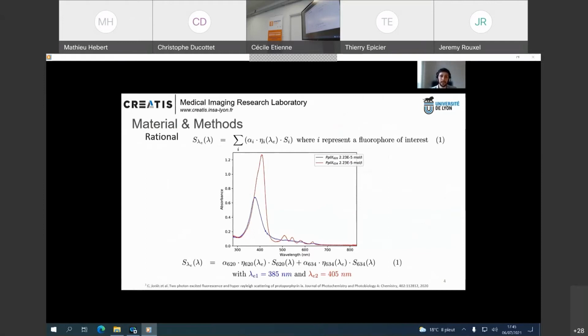the postulate that each of the states of a fluorescent molecule has its own spectral response and absorption spectrum. Indeed, getting the fluorescence response of the same sample when excited at each maximum of absorption enables us to estimate the contribution of each state of PpIX without any a priori on other endogenous fluorescence spectra. We decided to apply this new generic method to our case of PpIX.